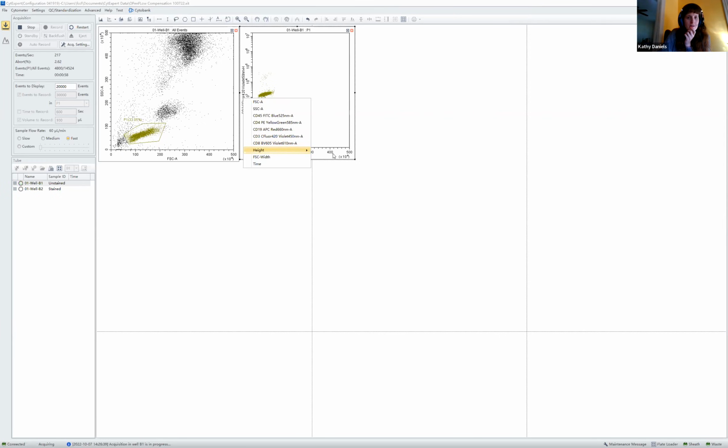I'm going to ask Anna or Chelsea, if you are there and you have the capability to choose side scatter height, I'll let you do that. If not, we can skip the singlet gating for today because it's not letting me do that. Thank you very much. I appreciate that.